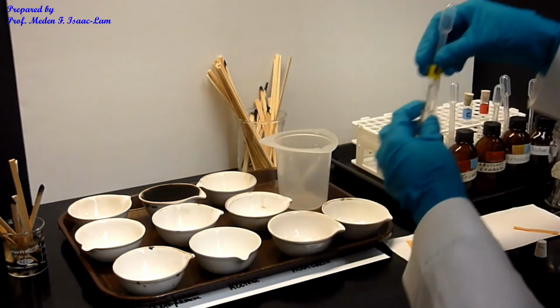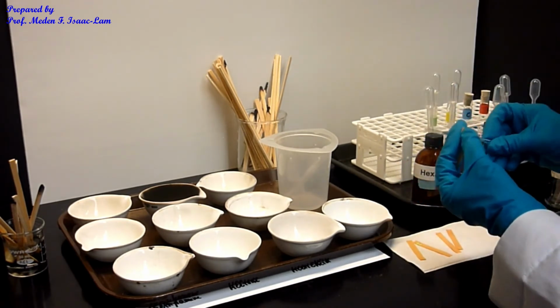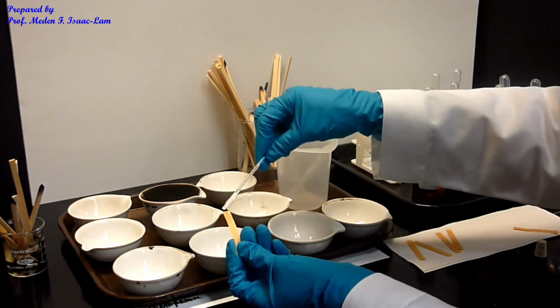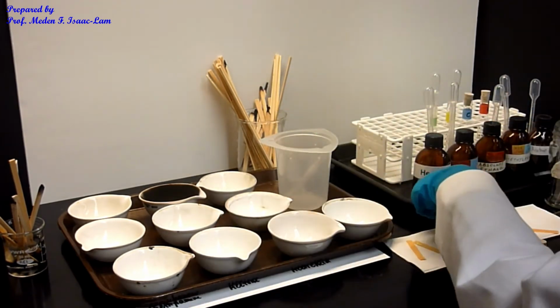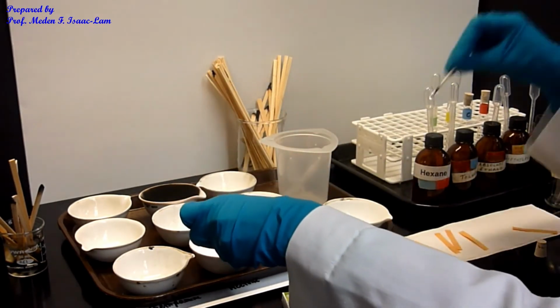Okay, so acidity, I can use this part here. So 6. All right, not acidic nor basic, almost neutral. All right, now flammability. Okay, it's flammable.